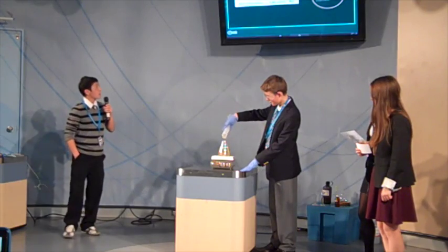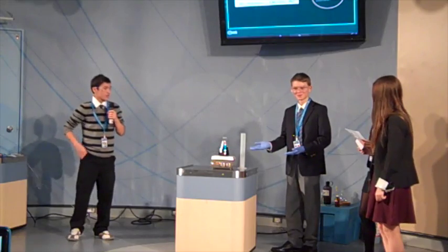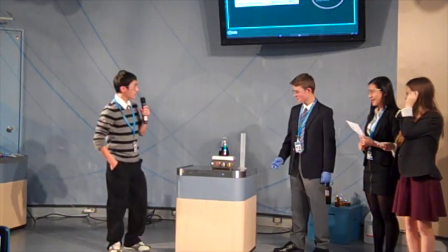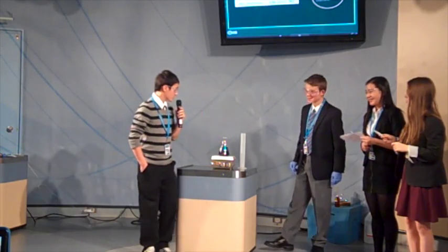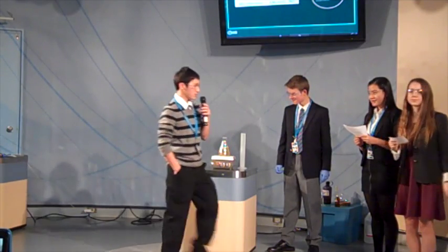Now my partners will explain what's happening as it goes along. So first off, Jenna is going to explain what's happening. As you can see, it just changed, and so here's Jenna.